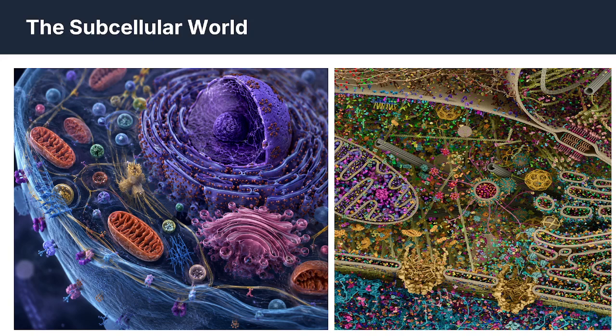Current vision foundation models have become highly effective in understanding the visual world around us. However, can we say the same about the world underneath the human cell? Let's start by discussing how to even visualize the extremely complex 3D subcellular world in its native state.